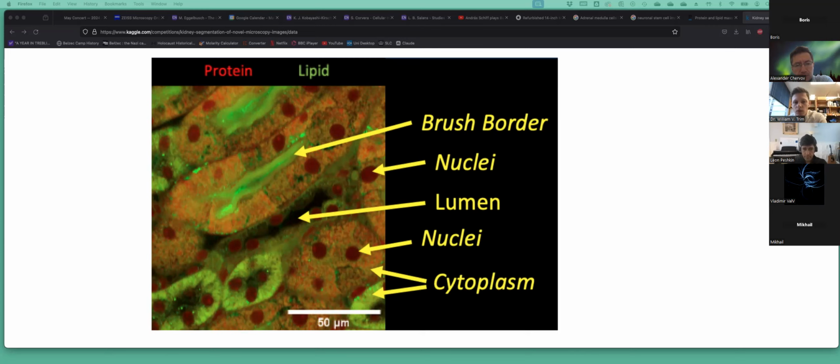Well, you need some interpretation from this model. Basically, I thought about what if we have, for example, healthy tissues and sick tissues. We just could do binary classification with some kind of transformer models, which build dependencies between visual features inside, and perform some exploration on the model weight level. For example, slice by layers and explore activations.